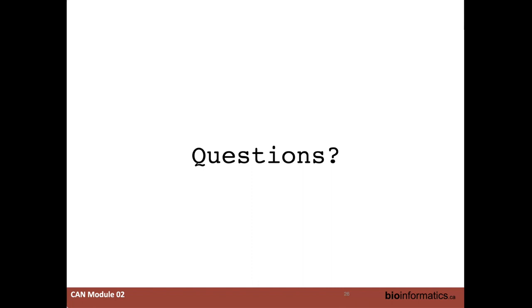That's great. However, again, there's no fixed standard, but most people will actually use either 60 or 70 characters in terms of the line width and then add a carriage return after that. But again, since it's not a standard, that is really dependent on the institute from which you're downloading that reference genome. UCSC, genome.ucsc.edu, will always, at least for the last three references that I've used, have always been 60 characters wide, and then a carriage return happens after that. Great question, though.